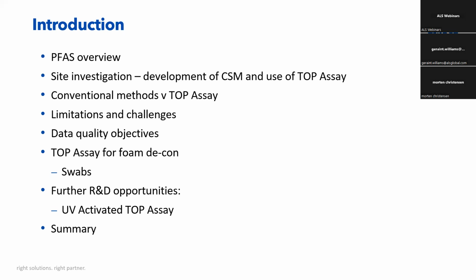There's this potential issue with rebound, so we can use swabs with TOP assay. And then a very quick glimpse at the future research and development opportunities. There's been some interest in UV activation for TOP assay, where we might see some advantages in terms of turnaround times, for instance. And then we're hopefully going to be able to summarize all the content of the presentation at the end.